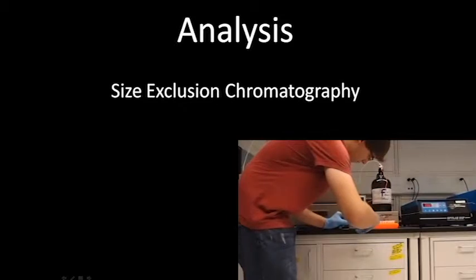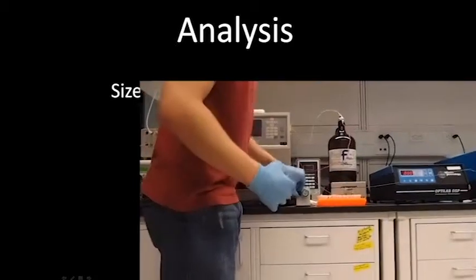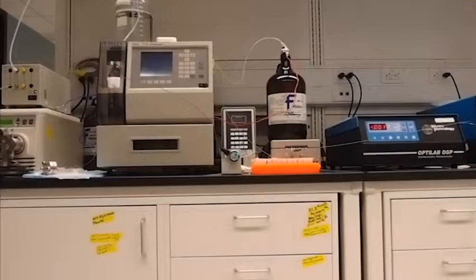Now onto the analysis. Here I am injecting a sample of PIA into the size exclusion chromatography column. PIA is found in a wide range of molecular weights, and I was interested in the size distribution that came from each protocol. PIA comes out of the column at different times depending on its size.